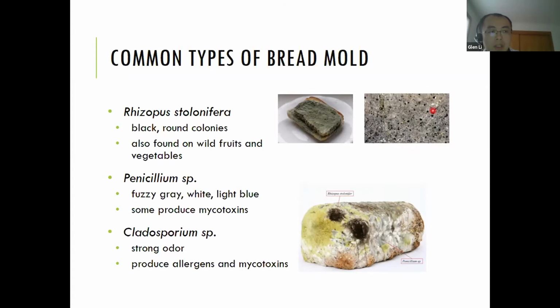It's usually dark green in color. Sometimes it can be black too. They can also look fairly fuzzy like Penicillium, so this one could be Cladosporium because it looks fuzzy. In comparison to Penicillium, which forms spot-shaped colonies, Cladosporium can be quite irregular in shape.